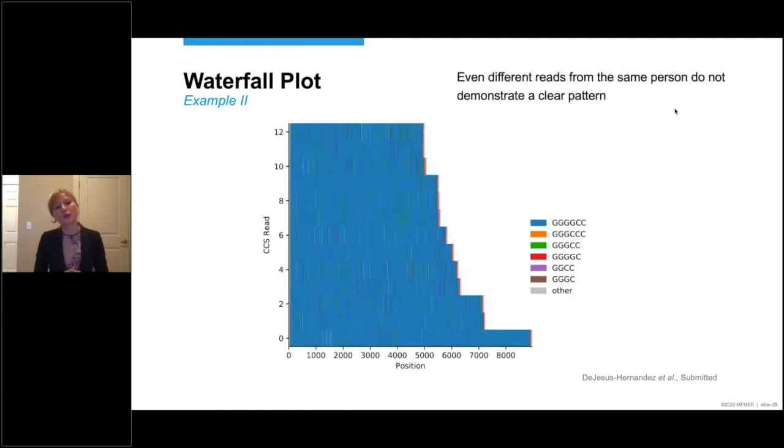This is another individual. And it's a slightly different waterfall plot. Because here, we're still specifying the GGGGCC repeat in blue. But other potential motifs are shown with different colors. The most common alternative motif appears to be the one with three G's and two C's. So one G less, and it's shown in green. And I realize it might be difficult to see on this slide. But really, even different reads from the same person show another pattern. So there is really no clear pattern.